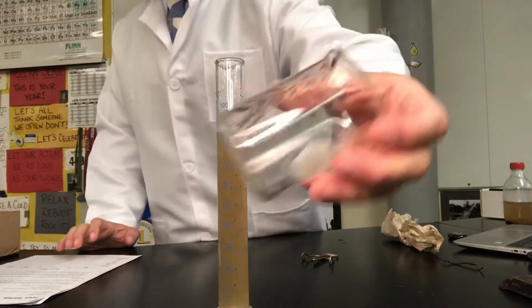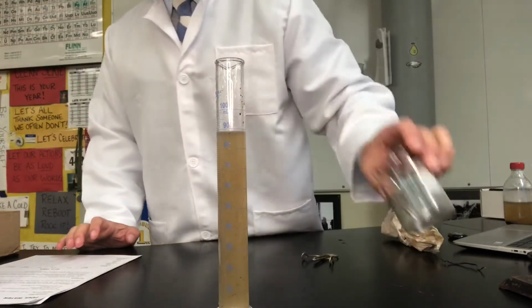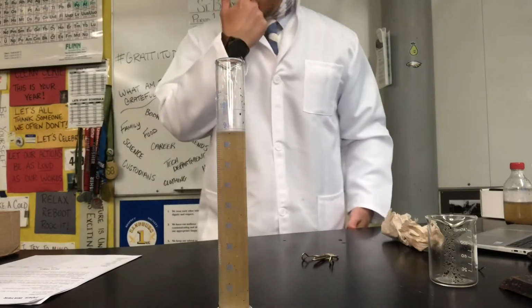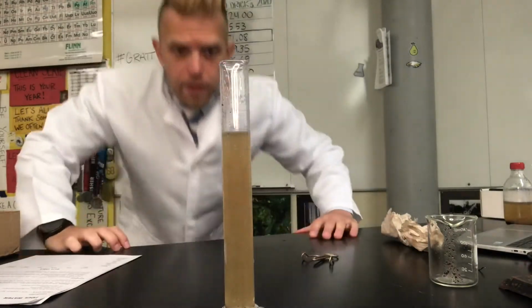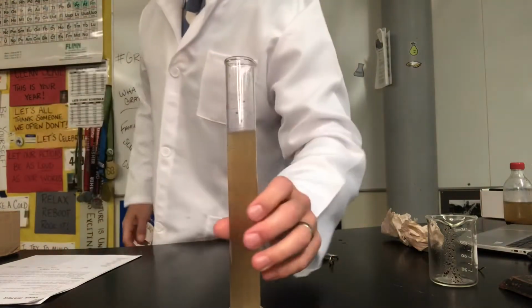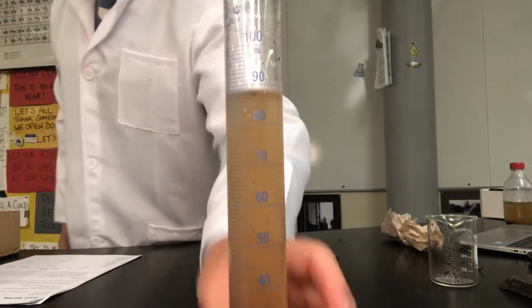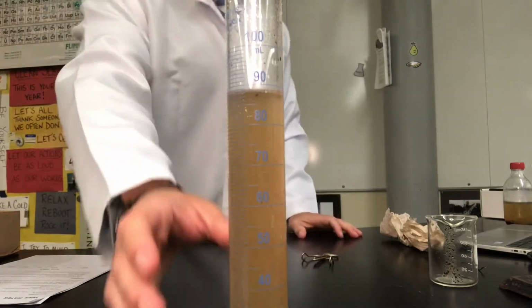And ooh, look at that, I already accidentally separated out some of the solids as well. So we'll use that to our advantage since we're trying to clean this water. But here we go. If I read this graduated cylinder, it looks like we have 89 milliliters of the liquid left. So go ahead and write that down under after oil-water separation.